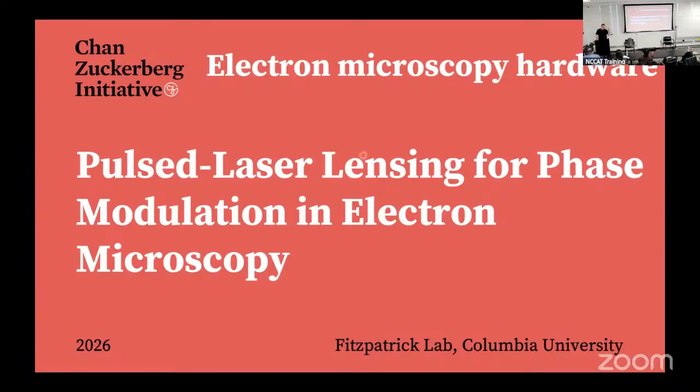So you have a source of radiation, which in this case is electrons, and you need a series of lenses in order to focus those electrons to be able to form an image. And those lenses were really invented almost a century ago. So the first electron microscope was developed in 1931. The very first one almost didn't resolve better than a light microscope, so it was barely better. But of course, electrons are intrinsically better for imaging than light because they have a much shorter wavelength. So if you're trying to resolve down to very, very small distances, you're always going to do better with electrons than you are with light.